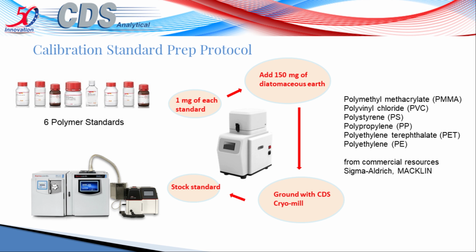These are known microplastics: polymethyl methacrylate, polyvinyl chloride, polystyrene, polypropylene, polyester, and polyethylene. These were all used as the stock standard.